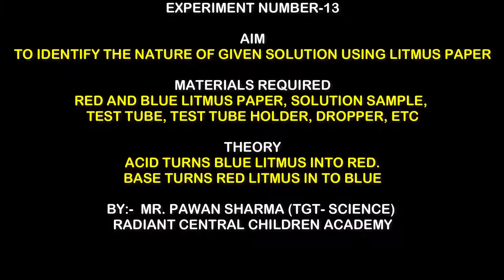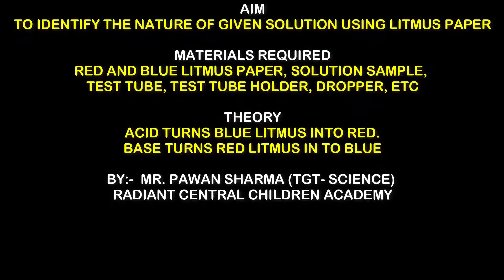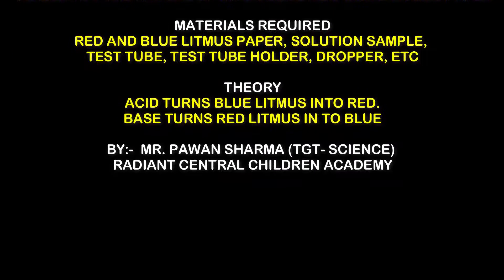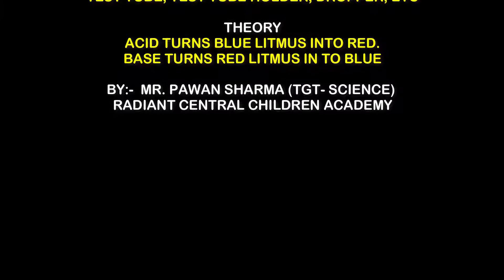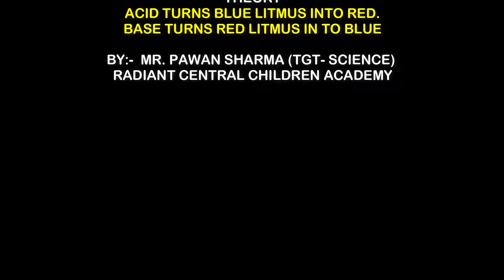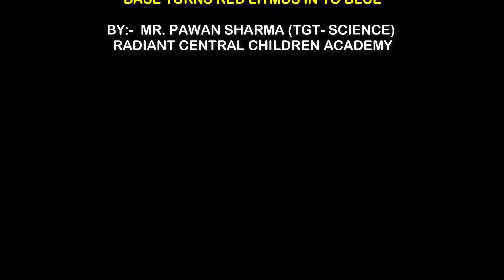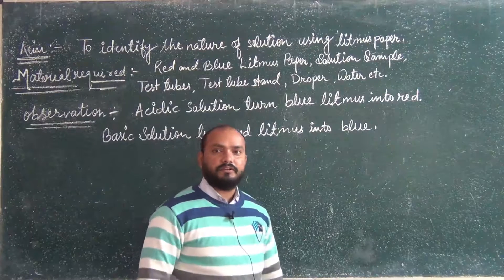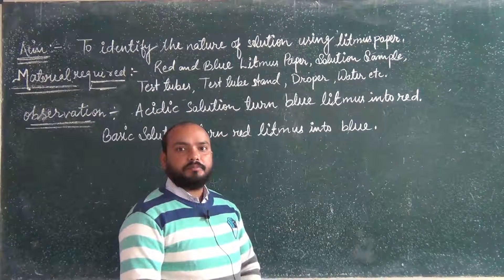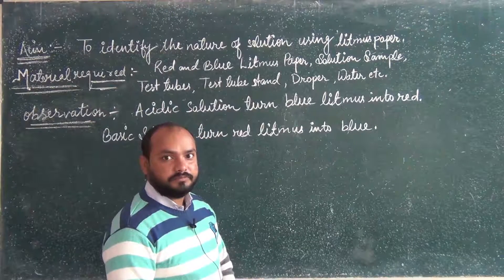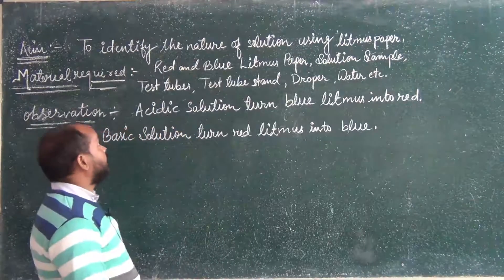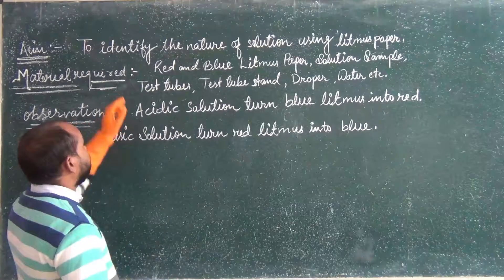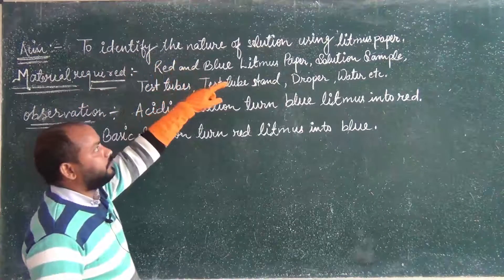Good morning students, welcome back to the science classes of class 7. Today we are here again to present an activity, and the aim of our activity is to identify the nature of a solution using litmus paper.